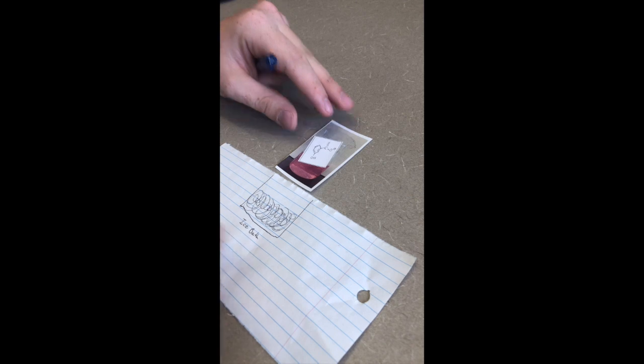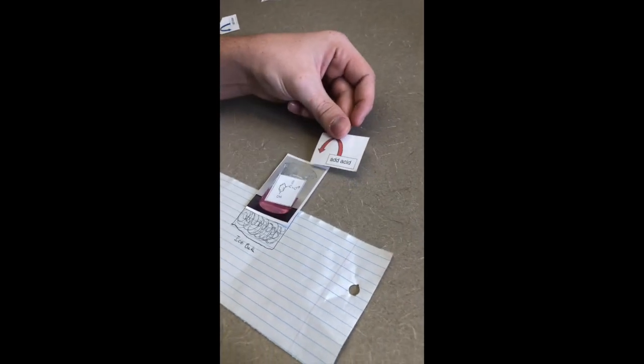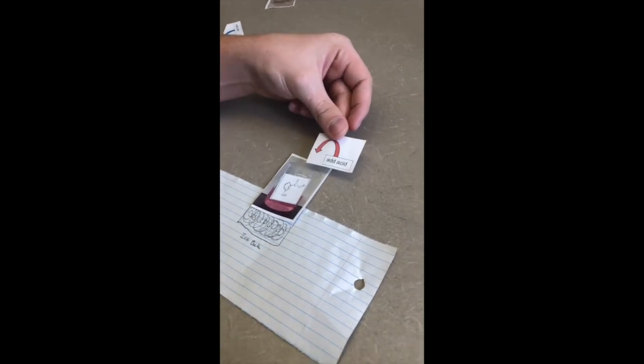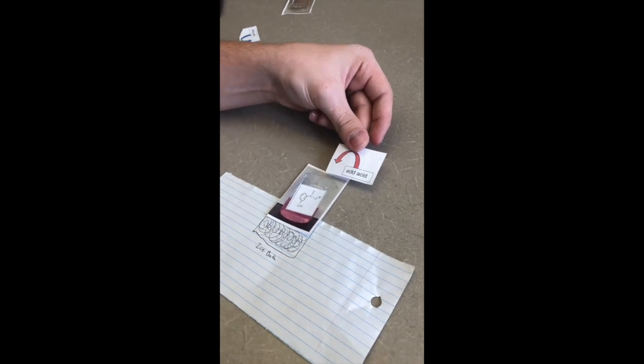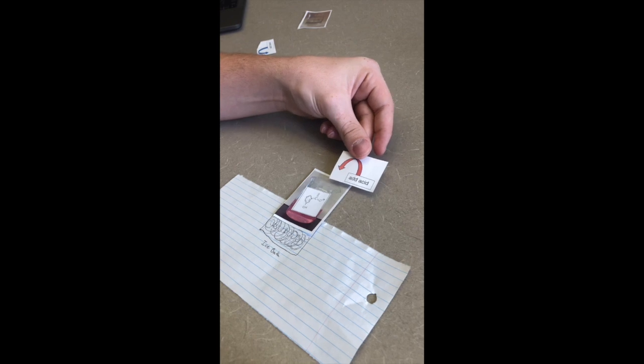Now we need to recover the acid. So we take our conjugate base and we're gonna put it into an ice bath. And then we're going to add some hydrochloric acid. And a precipitate is gonna form as we're getting that original solid acid back. So now, once we get that solid, we're going to test the pH. So we want a pH of 1 or less.